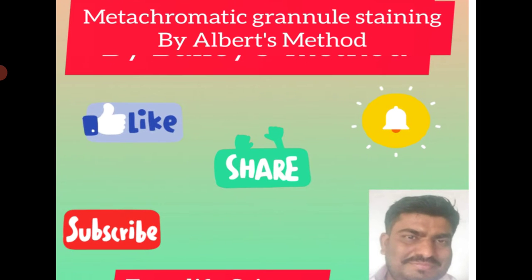Here in this lecture, I am talking about a metachromatic granule staining technique by Albert's method.